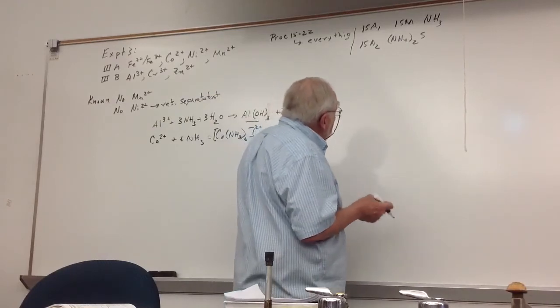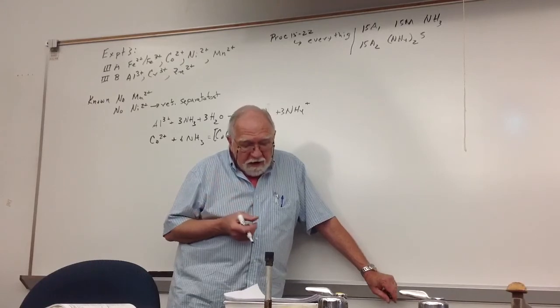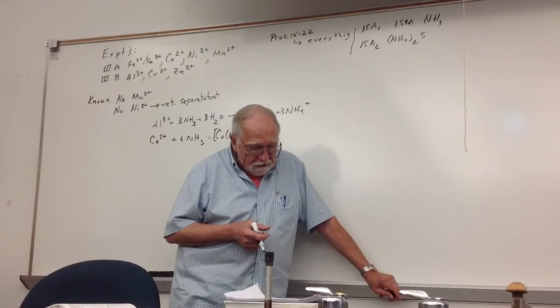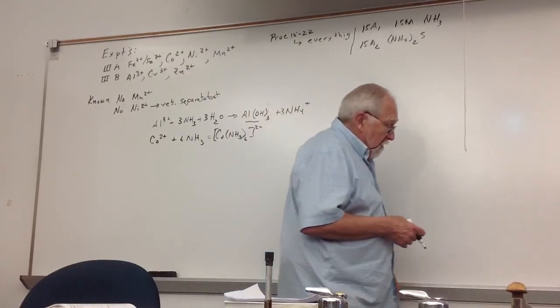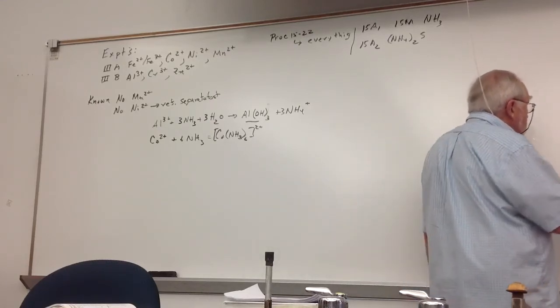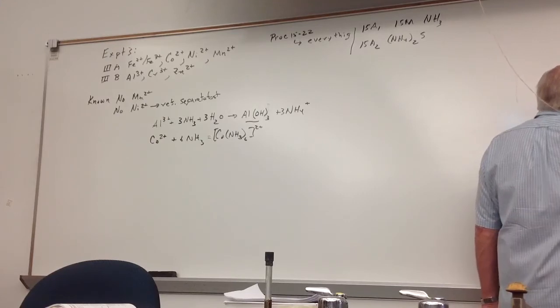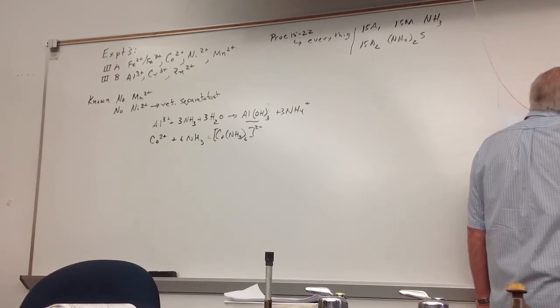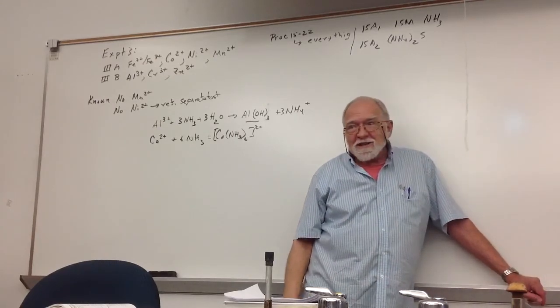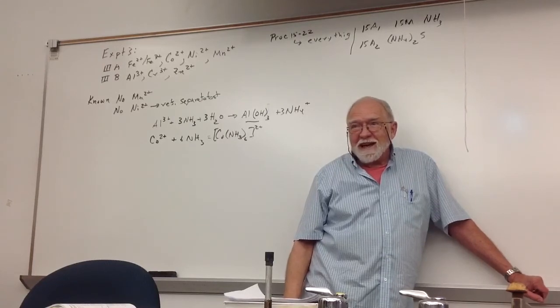Okay? And the other thing that happens, everything's going to turn black in your test tube, even though the nickel is not there. And when you're working with the unknown, it's possibly due to nickel. If you don't get any dark color precipitates at all, that means you don't have some of the things that could give you black precipitates. But what happens is, your test tube looks like that. And you centrifuge it, and it still looks like that. And you centrifuge it some more, and it still looks like that.